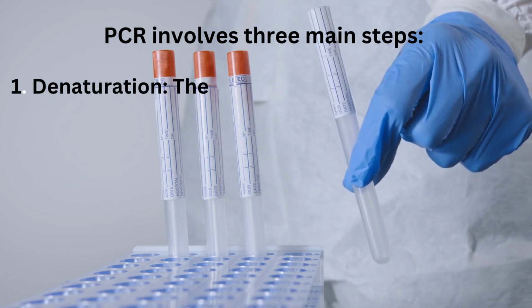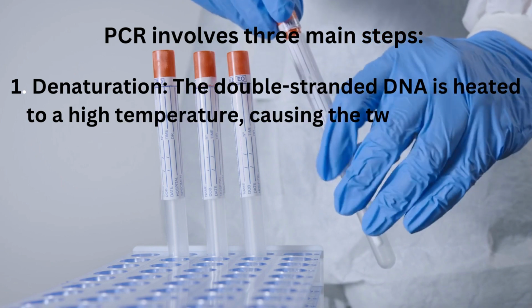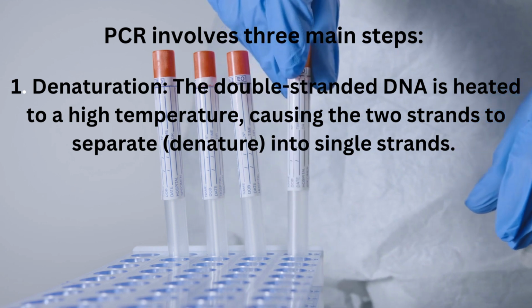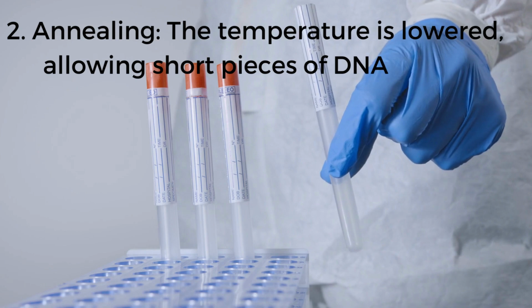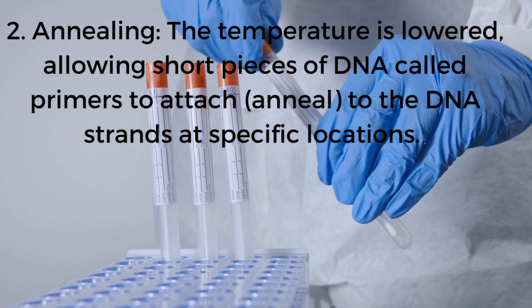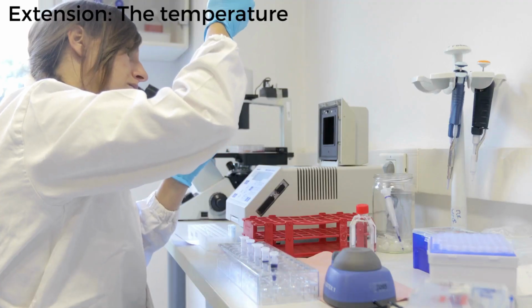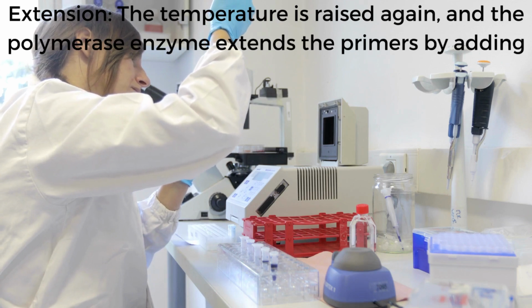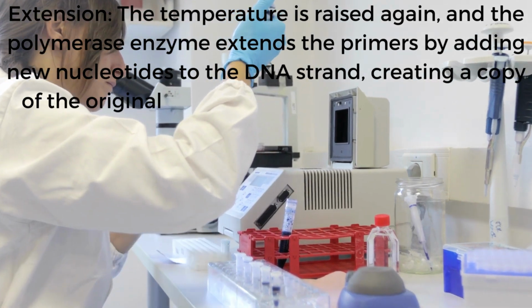PCR involves three main steps. 1. Denaturation. The double-stranded DNA is heated to a high temperature, causing the two strands to separate, denature into single strands. 2. Annealing. The temperature is lowered, allowing short pieces of DNA called primers to anneal to the DNA strands at specific locations. 3. Extension. The temperature is raised again, and the polymerase enzyme extends the primers by adding new nucleotides to the DNA strand, creating a copy of the original sequence.